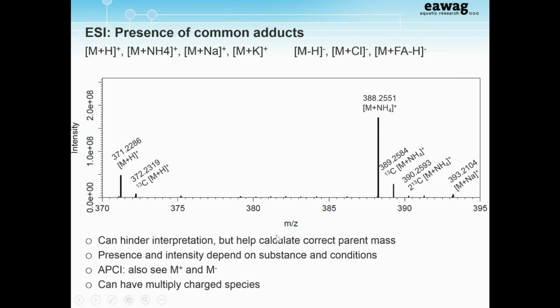And I haven't mentioned it yet, but just to remind you all that mass spectrometry is actually a mass to charge ratio, not just a mass on the mass spectrum. And this is because you can actually have multiple charge species. So if you start to see, for instance, your isotope pattern coming at 0.5 mass units, this is already a warning that your Z or your charge is actually 2, and that the mass is actually double what you're seeing in the mass spectrum.